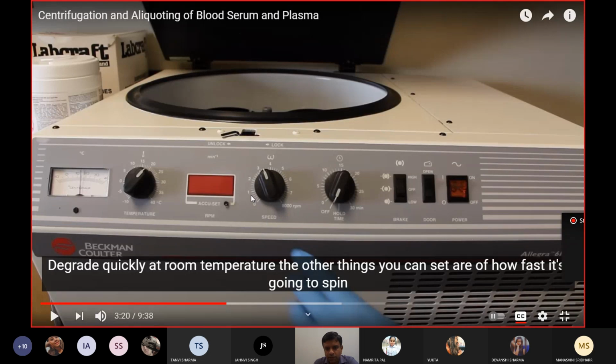This is 1000 rpm, 2000 rpm, 3000 rpm. This 1, 2, 3, 4 is the rpm, or the revolutions per minute. How many revolutions will the centrifuge tubes make in a minute? Usually for serum separation it is somewhere around 3000 rpm.